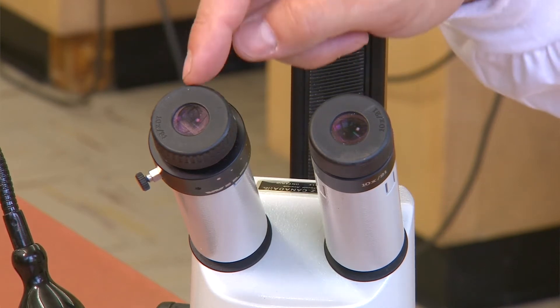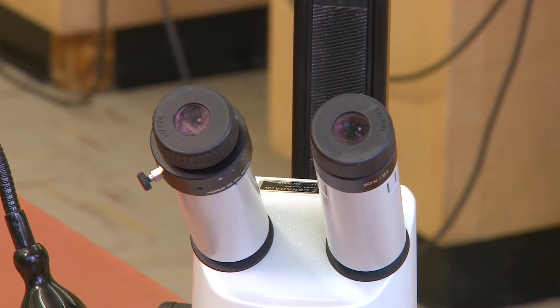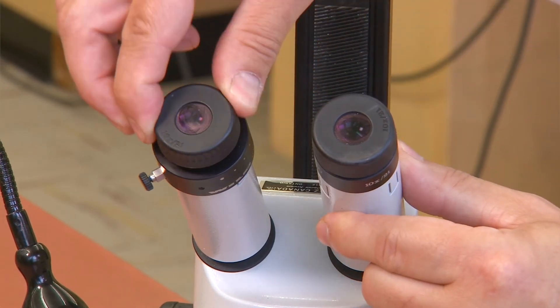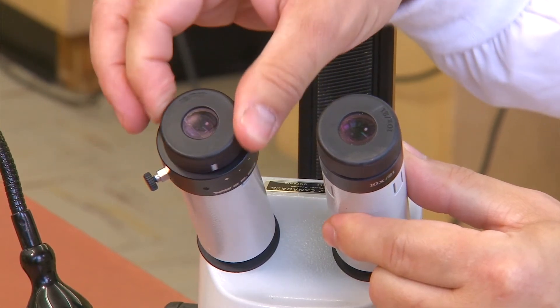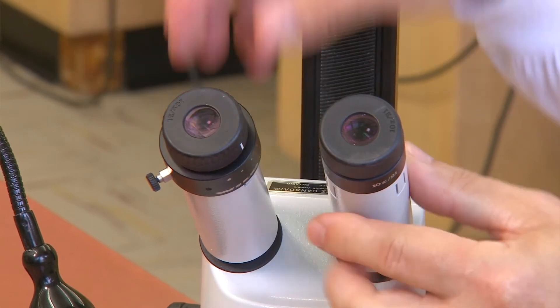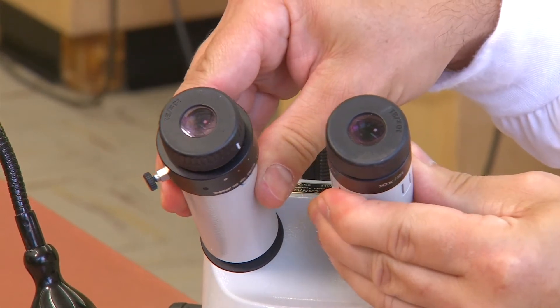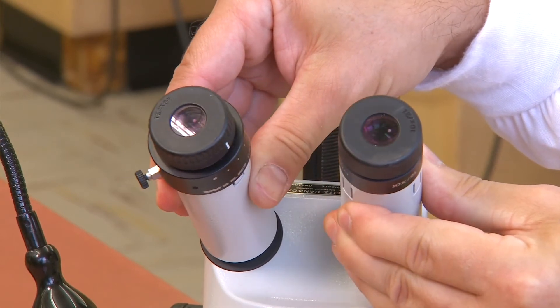Beginning at the top, we have the two ocular lenses, also called the eyepieces, which you look through to see your slide. The left ocular has an adjustment ring near its base. This ring is used to help compensate for differences in vision between your eyes. The distance between oculars can be easily adjusted by simply moving the oculars together or apart.